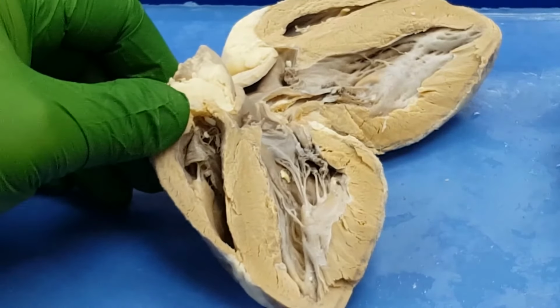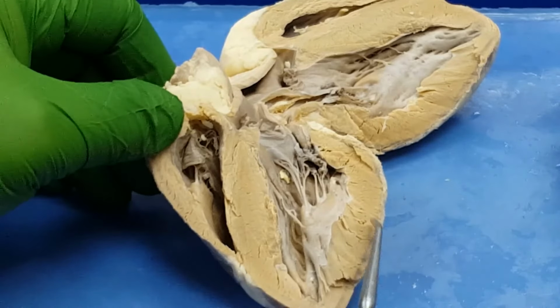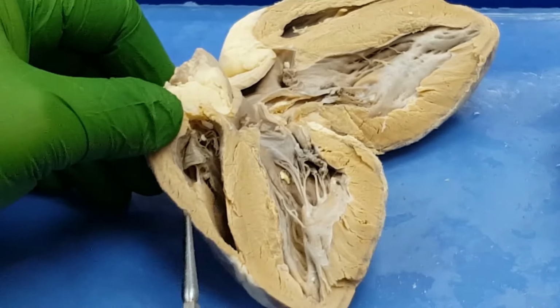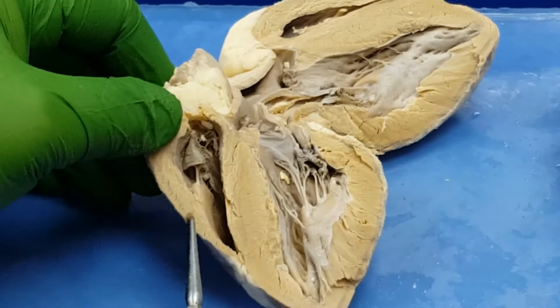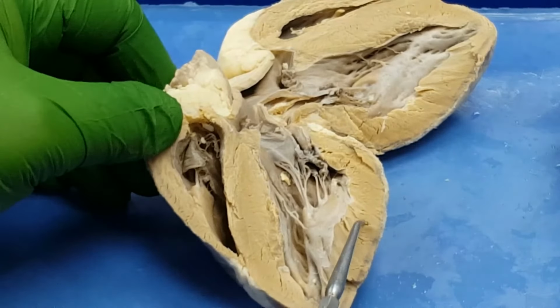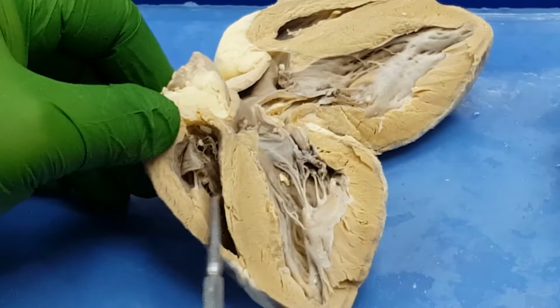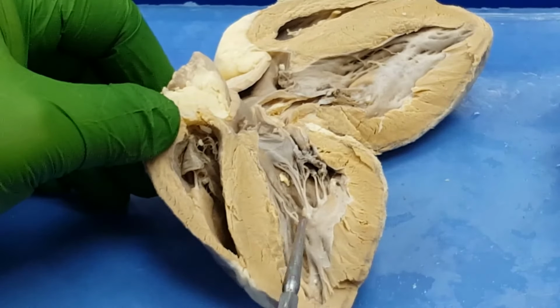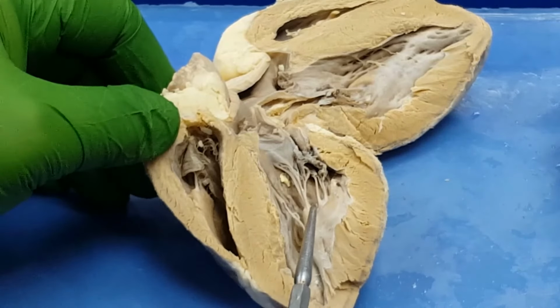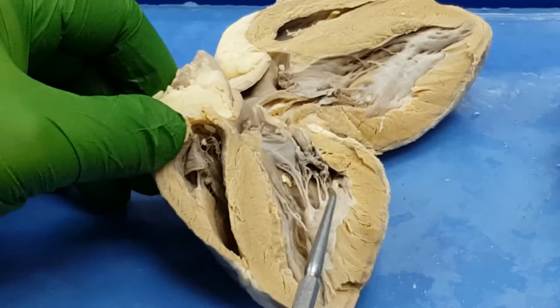How can I tell so quickly? Well, look at the thickness of this myocardium right here as compared to the thickness of this myocardium over here. Always use the thicker myocardium in the left ventricular wall to orient the four chambers of the heart. Once you know this one is the left ventricle, then identifying the other chambers gets pretty easy, doesn't it?